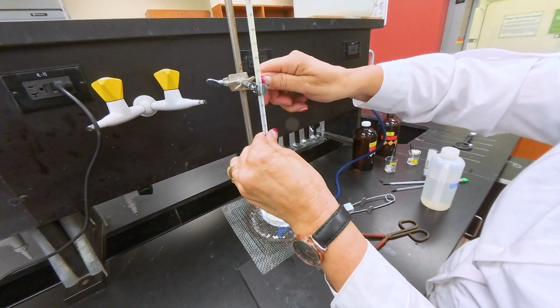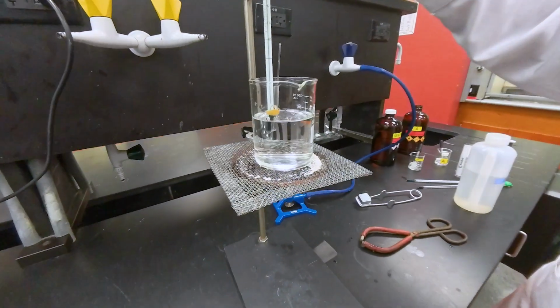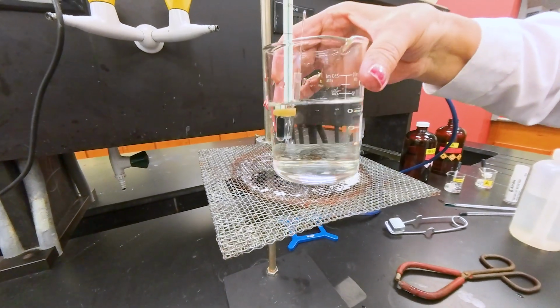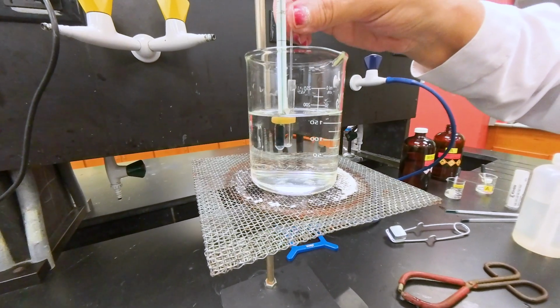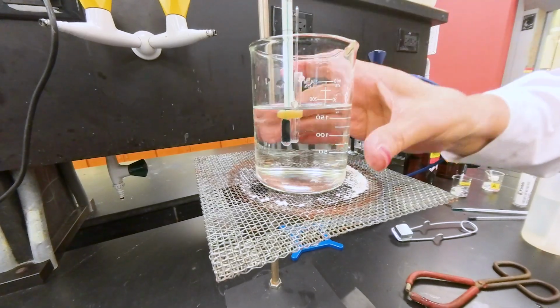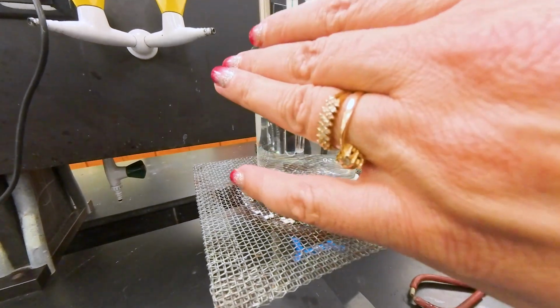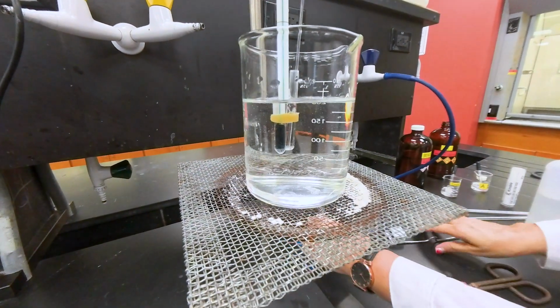So we are going to place the sample at the proper level again. We want to make sure that the liquid is inside the water, and we'll show you the capillary tube where it's located. The bubbles that started because the water was warm start coming out, and we are going to turn on the Bunsen burner, place it underneath, and wait for boiling.